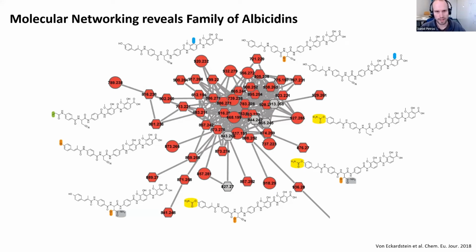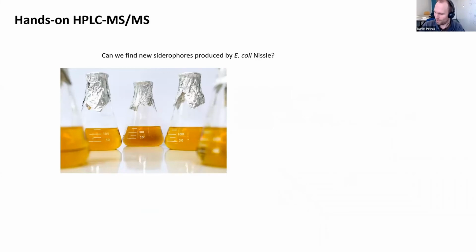And I think for the seminar, learning how to make molecular networks, deal with this data and visualize it will be one of the main learning objectives. All right, but now enough of the theory for today. For the next 15 minutes, I actually want to do some hands-on examples with you, where we're going to dive a little bit into LC-MS data, and also take a brief look at the molecular network and try to navigate a little bit in that space.